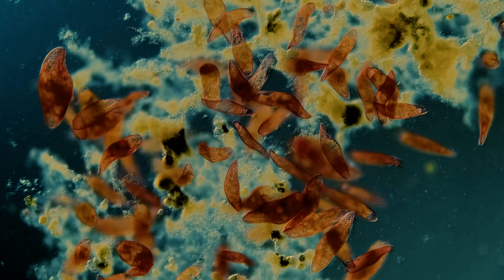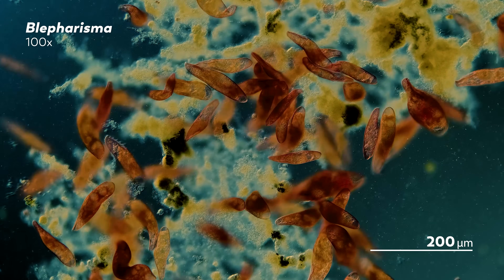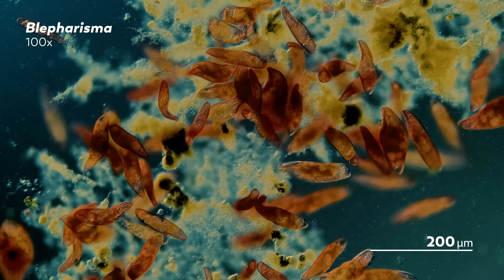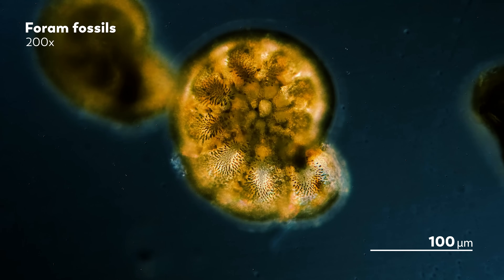One of the most common questions we get asked here on Journey to the Microcosmos comes from all of you who are thinking of starting your own microscopic journeys and want a little nudge in the right direction. The question, of course, is: what microscope should I use? And that's a big question to answer, actually.